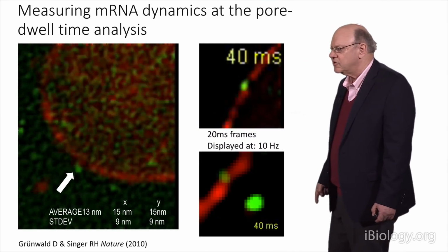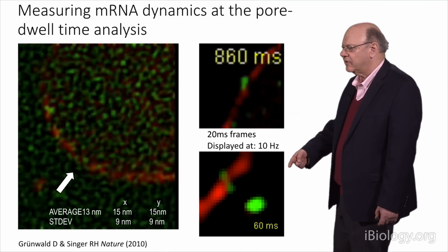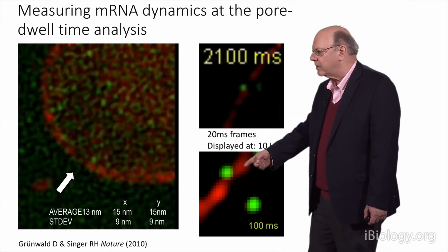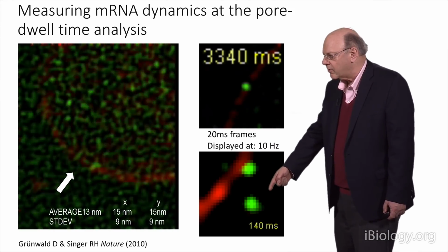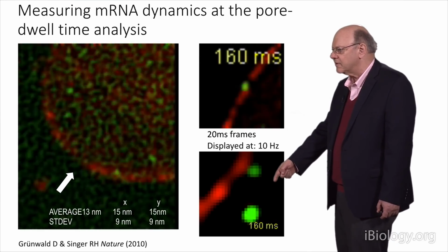And then we can zoom in on some of this. And here is a high magnification of RNA going through the pore. So the center of the pore is right here, and you can see the RNA going through, and you can see the clock running down there. And the time is approximately 160 milliseconds.